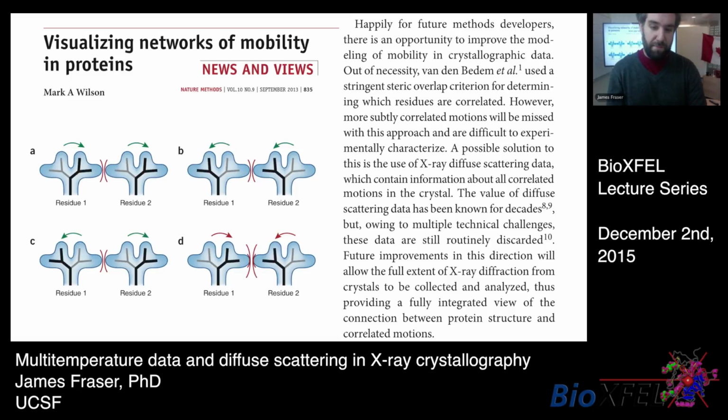And so here he writes, a possible solution to this problem is the use of X-ray diffuse scattering data, which contain information about all correlated motions in the crystal. And this is something that we were already thinking about, and it was nice to read an outsider's perspective that he was thinking along the same lines we were at the time.